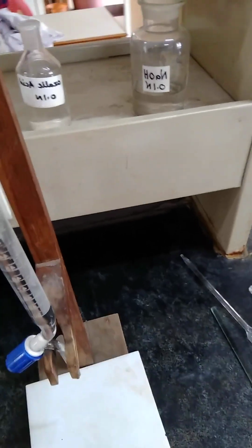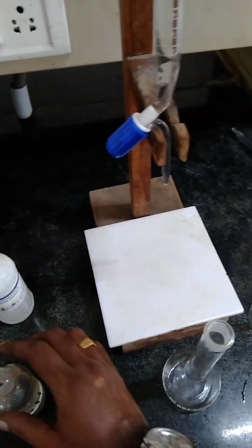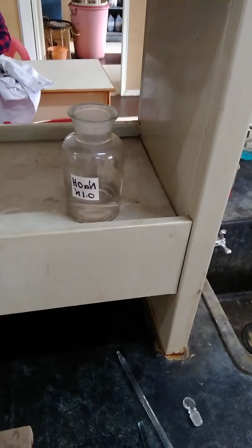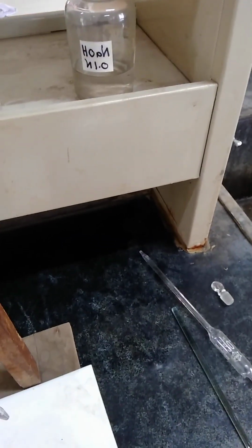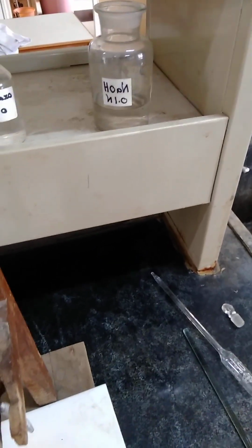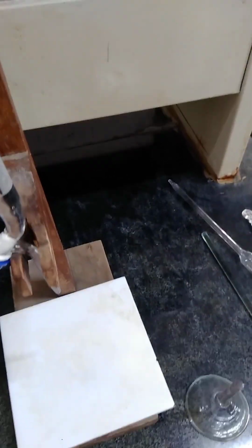This is the estimation of HCl, the second titration. We have to make up the HCl and then titrate against the NaOH whose normality is already calculated. For this demonstration, we just have to make up the unknown sample.